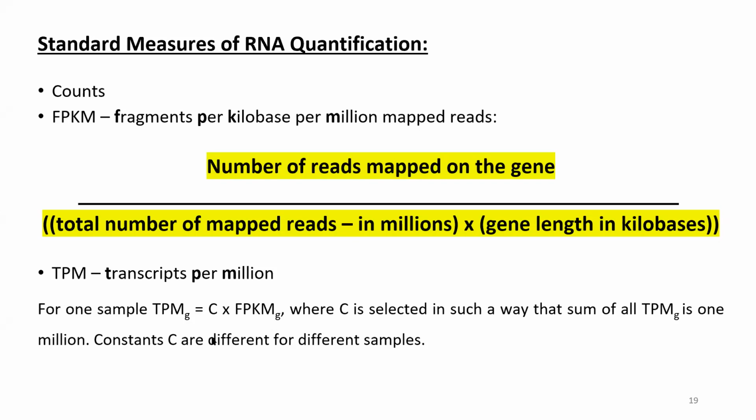If you have a bucket of water and you are measuring a cup of water, you have to understand what the total water in the bucket is in comparison to the water in the cup. If you really try to compare, you bring the cup over to the bucket at the same proportion. Now, even if somebody comes up with a whole cistern of water, the proportion becomes different, as you can understand. So FPKM, TPM, RPKM basically are different types of proportions that come into play, and definitely the strategies of quantification are different. These are different strategies of quantification of the RNA-seq data.